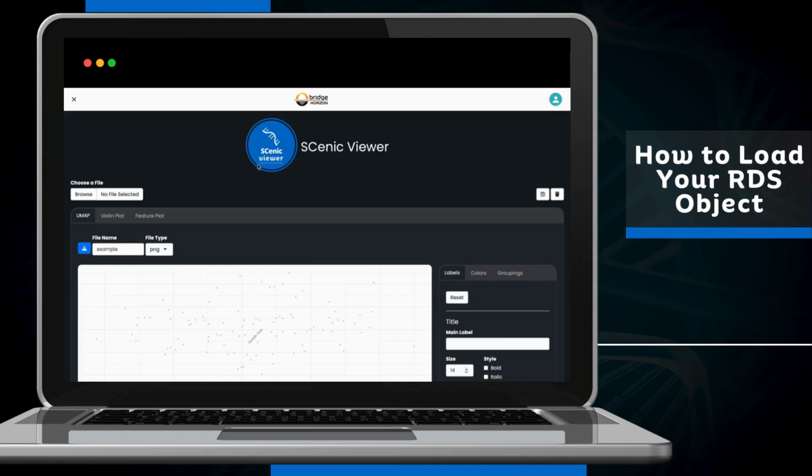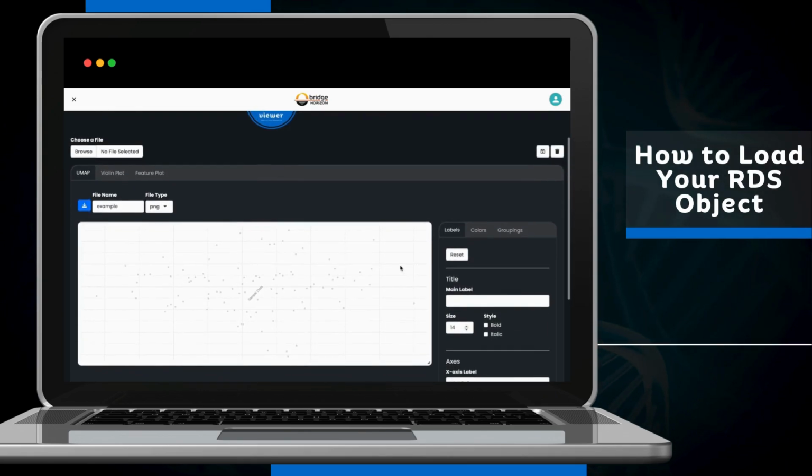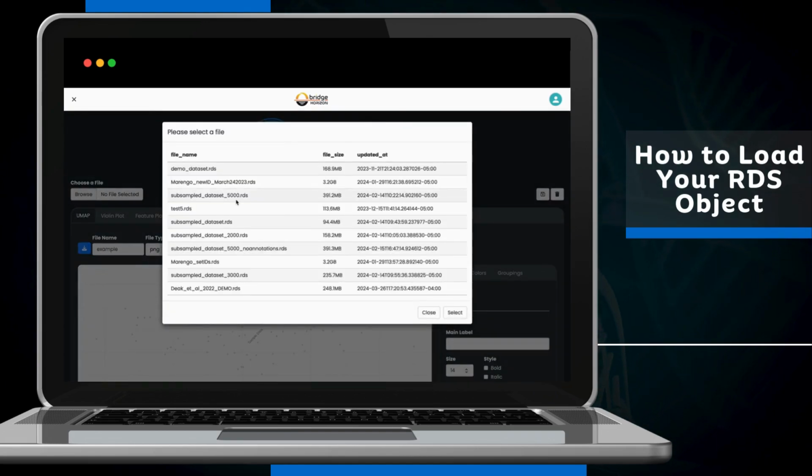So once you are here, you can see the plots over here are just fillers. In order to load your data set, all you have to do is click Browse under Choose a File. Once you click Browse, this will list all the available RDS objects that you have access to within Horizon. And once again, this will only list the RDS objects.